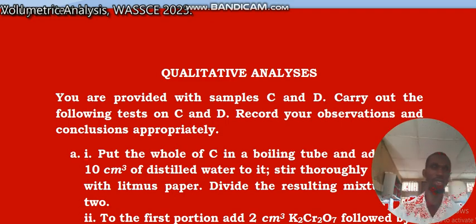Welcome to Excellential School of Chemistry, and we are here presenting qualitative analysis of this year's WASSCE examination in chemistry.